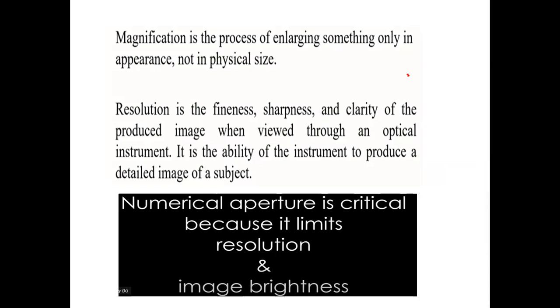But these 2 objects, which appear as a single object, are 2 different entities. They are so close to each other that they appear to us as a single object. So in a microscope, we can resolve these 2 points. That is, we can resolve the single point which we are seeing into 2.